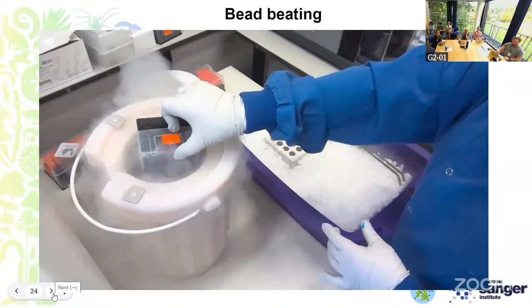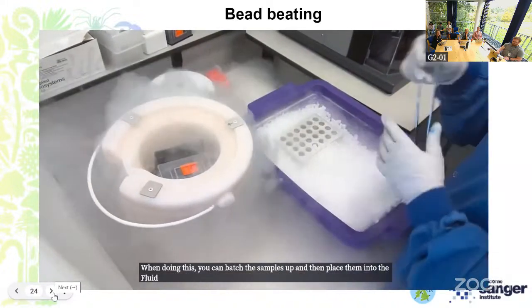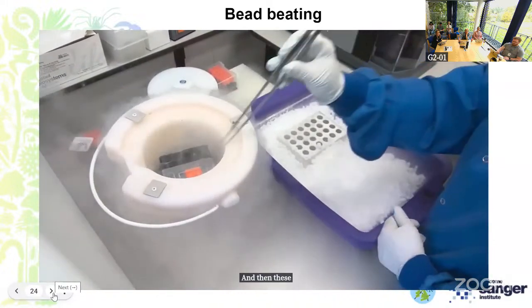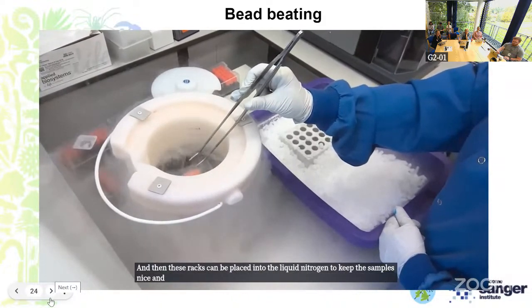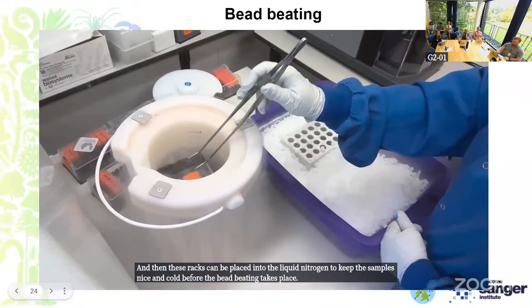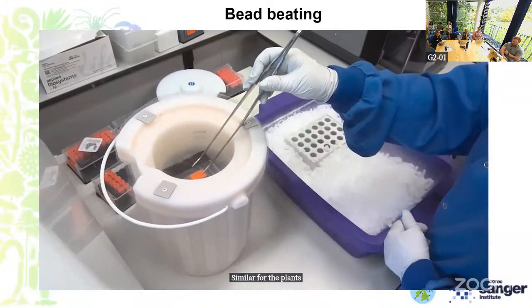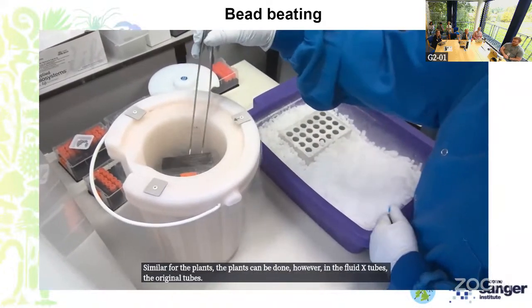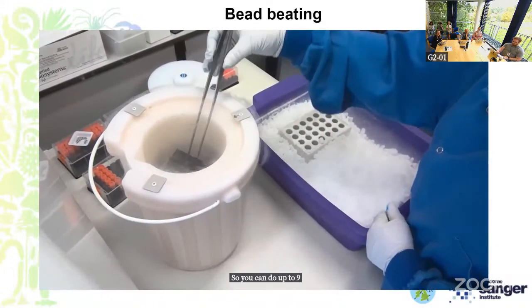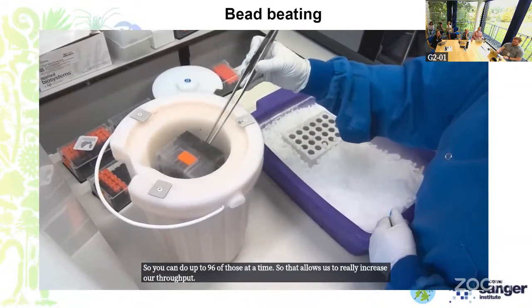When doing this, you can batch the samples up and then place them into the Fluid X racks, and then these racks can be placed into the liquid nitrogen to keep your samples nice and cold before the bead beating takes place. Similar for the plants. The plants can be done, however, in the Fluid X tubes, the original tubes. So you can do up to 96 of those at a time. That allows us to really increase our throughput of the samples and batch them up.